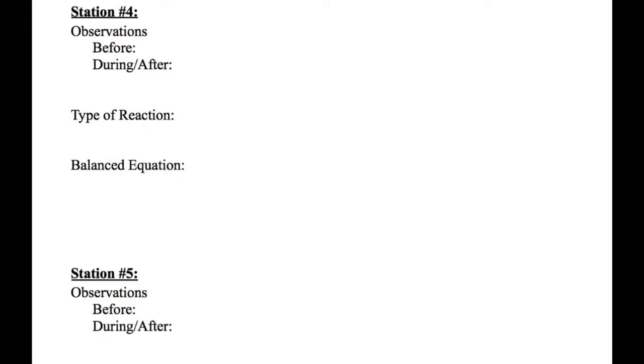Even if you think it's boring, there is important stuff for you to be noting that's different in that during and after part. So I need you to make those specific observations there.